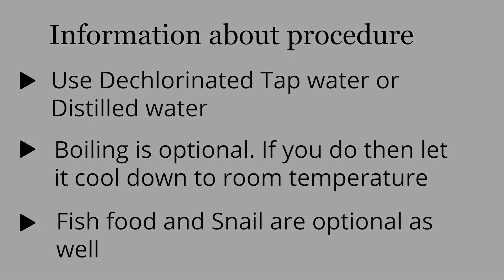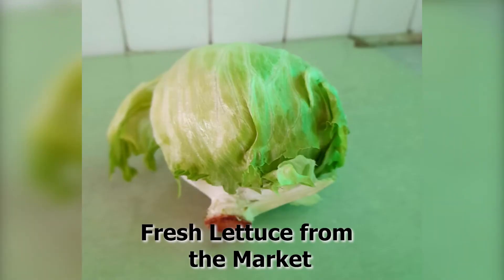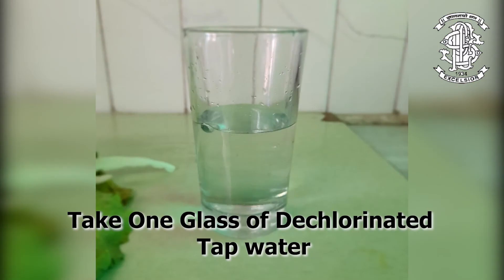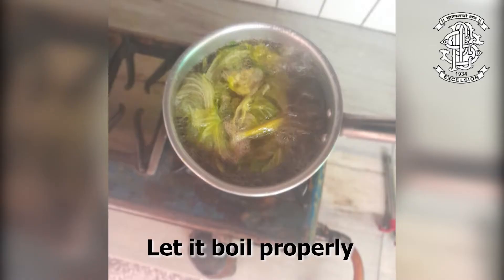Let's get started. For the procedure, I took green leafy vegetables, i.e. lettuce, and peeled it off. You can also take other leafy vegetables like spinach or kale, fresh or stale by a week. After peeling it off, I took dechlorinated tap water and boiled the lettuce with it. Let's call this sample number 1.